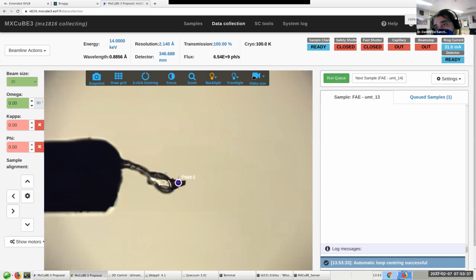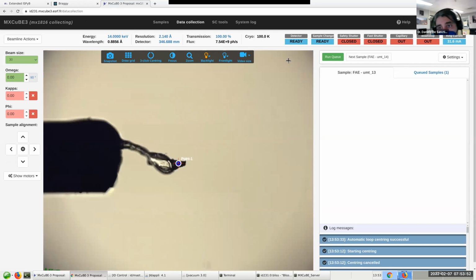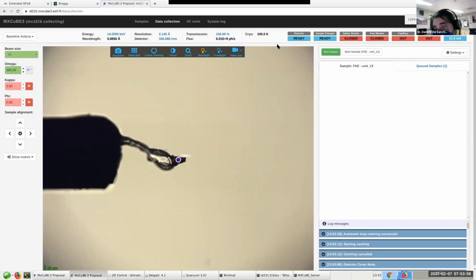If I'm on the wrong resolution, some details might not be shown correctly because there is no space for the buttons and the like. So we just recommend to unzoom until you see the whole interface properly displayed. Of course, here we are on a large screen with a high resolution, so that's not such a problem. Okay.